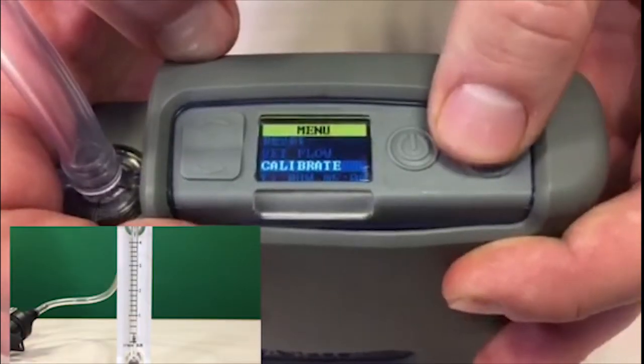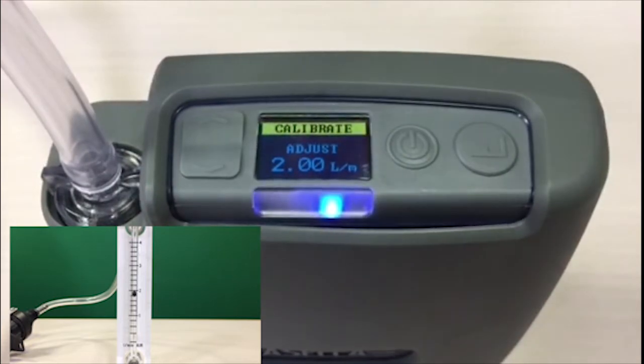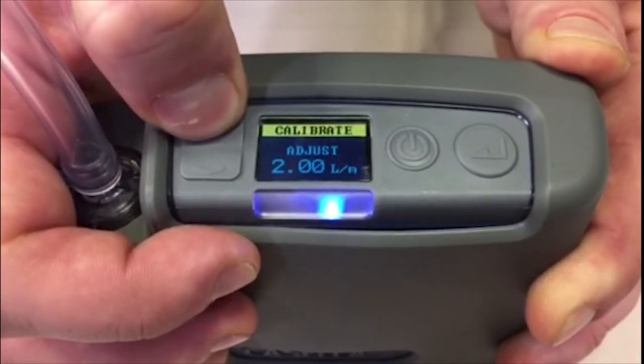Then select 'Calibrate' from the menu. Reading the flow from the centre of the bob on the flow meter, use the up and down cursors to adjust the flow to the required level.